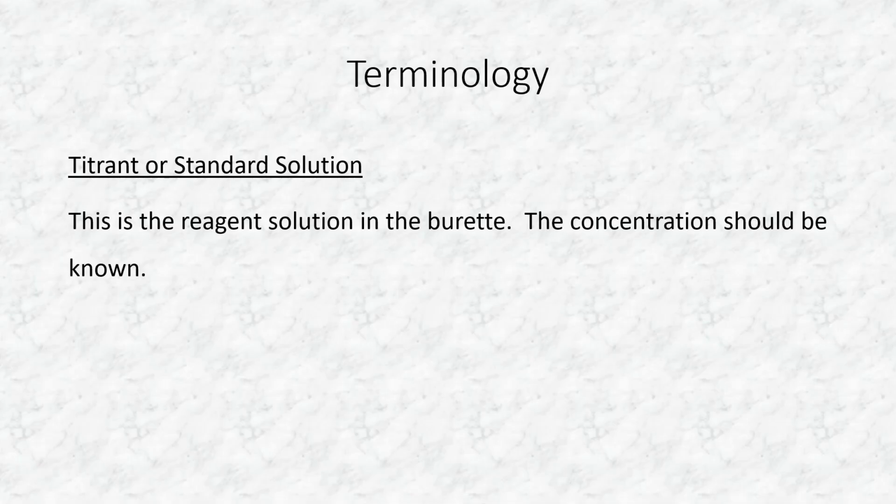And that brings us to talking about what we mean by titrant or standard solution. These are the same thing, they're just different phrases for it. This is the reagent solution that you put in the burette, the solution of the reactant that you use to measure the concentration of the sample substance. You do need to know the concentration of this substance, of the titrant, and that's why it's sometimes called the standard or the standard solution, because it has that standard or known concentration.